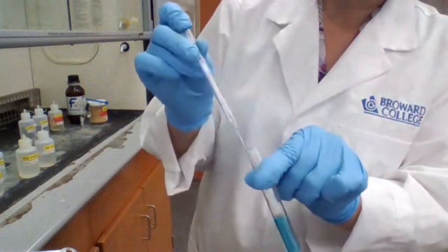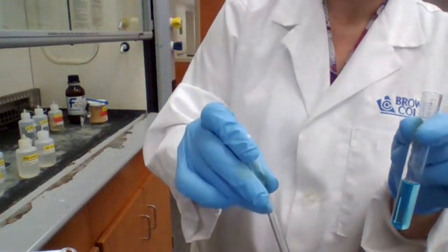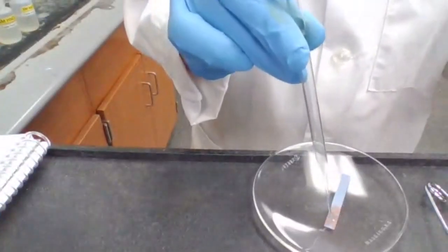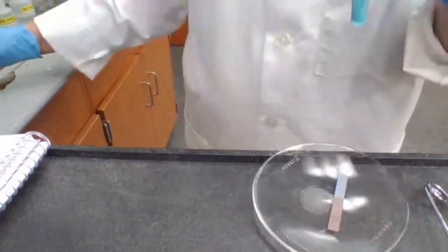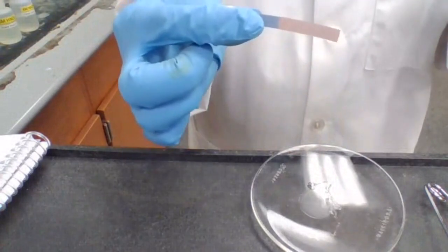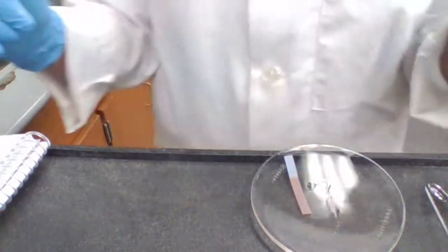But after there's the color change in the solution, I can now add drops to the litmus paper that I have in the watch glass. And I could see this is changing color from blue to pink, and the solution is acidic.